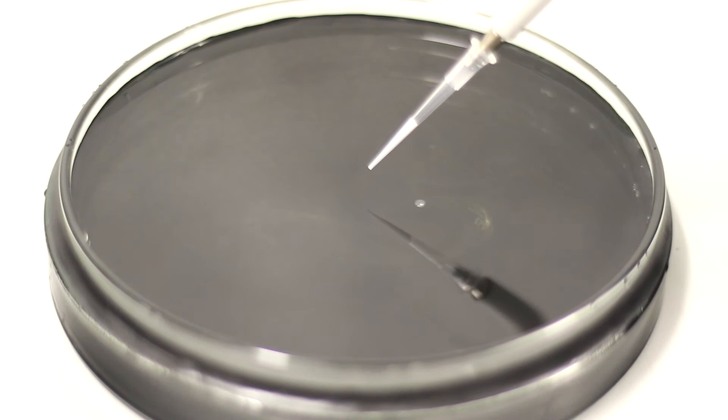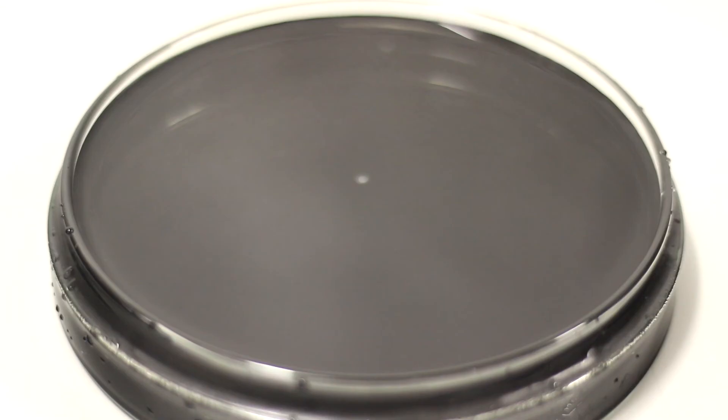However, if we add ethanol to our suspension, the reduced surface tension of the solution will encourage interfacial mass transfer across the surface of the water and not into the bulk.